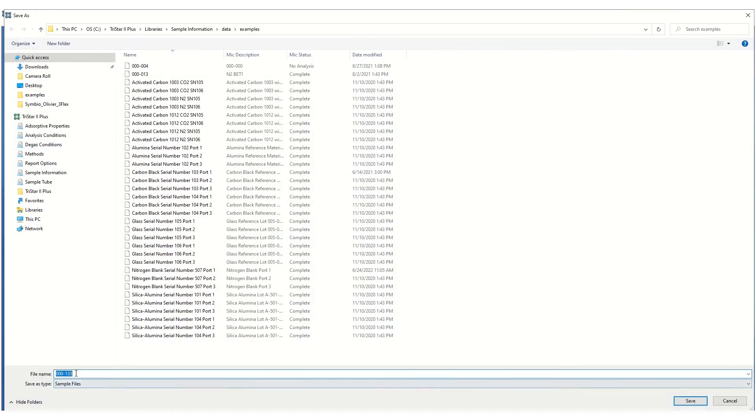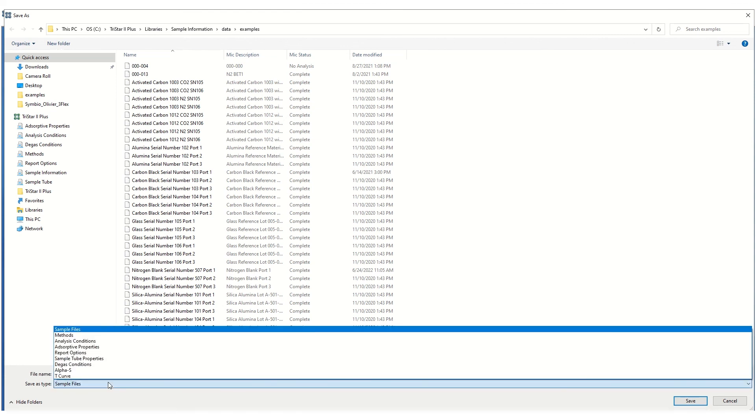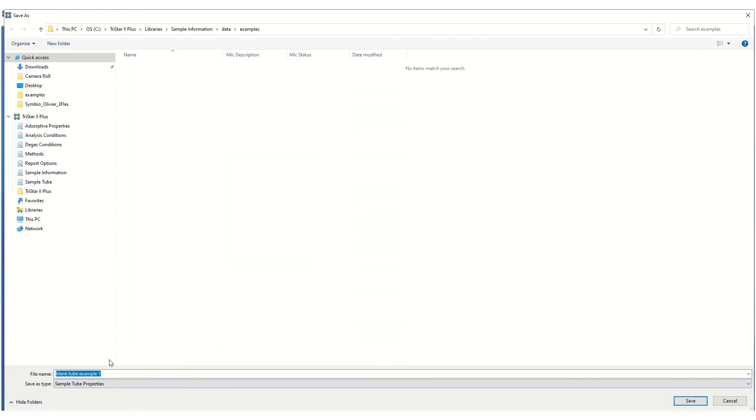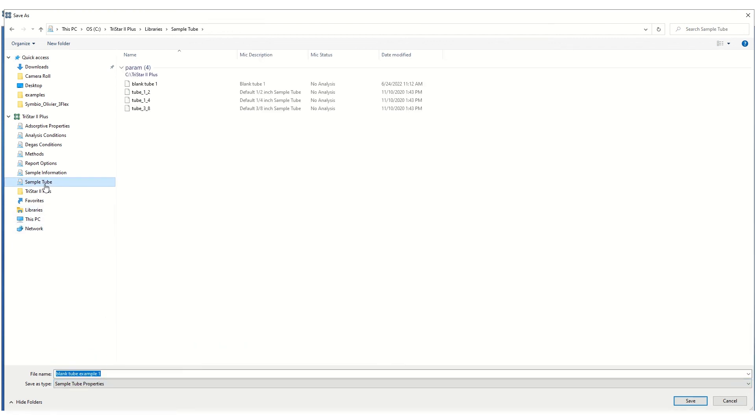Rename the file name appropriately, change the file type to Sample Tube Properties, and save it under the Sample Tube folder.